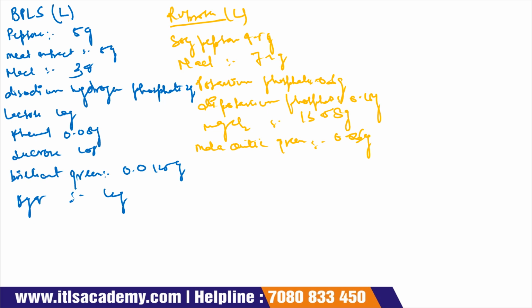Now the next composition is for xylose lysine deoxycholate, also called XLD. Again this composition is for 1 liter.